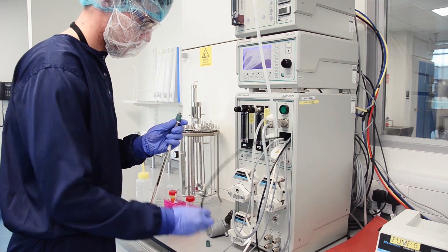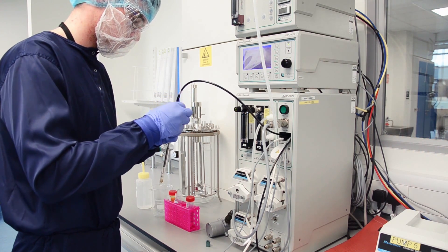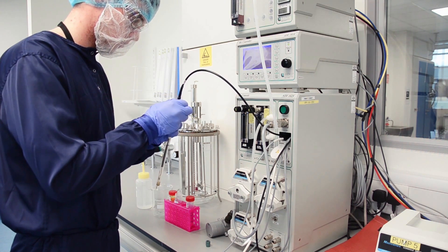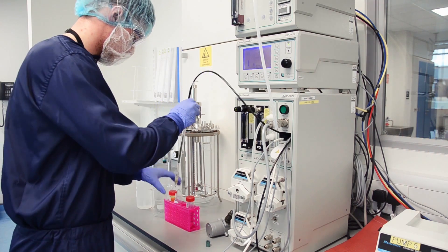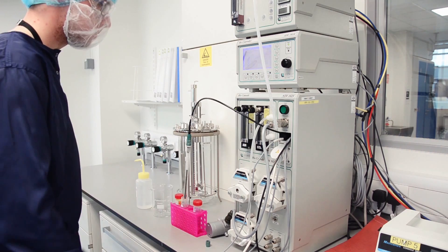A pH probe measures the hydrogen ion concentration of a solution. The cap is first removed from the probe. The connection to the controller box is attached and the screen is set to the calibration setting.